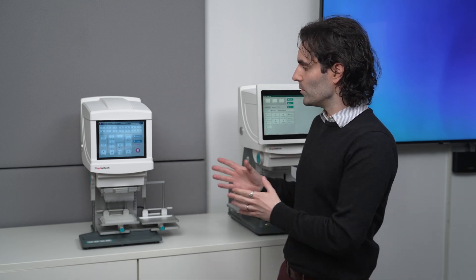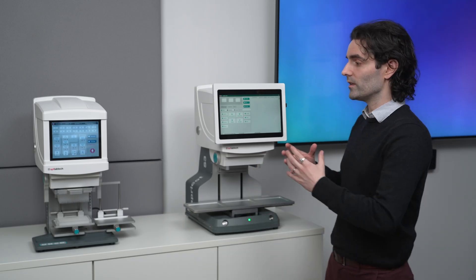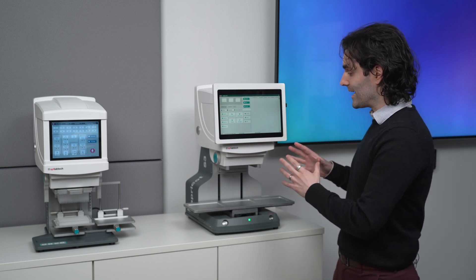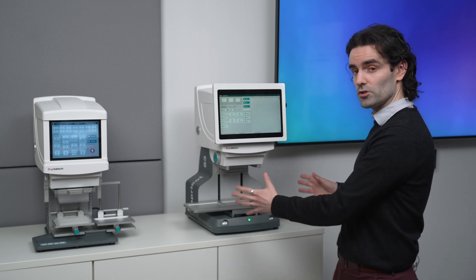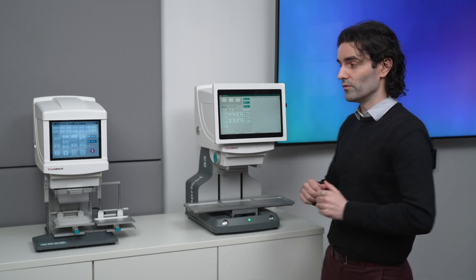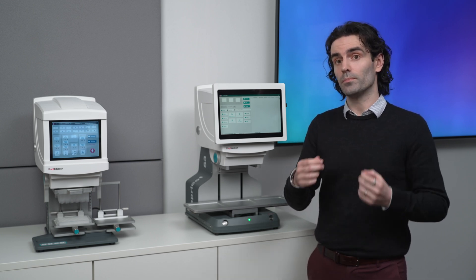Moving on from the S1, here we have the S3. The S3 is very similar to the S1 — it has a lot of the same strengths in that it's very easy to use with a nice big interface — but it actually has an automated deck. In this case, you have an additional deck position, three total, and you can do the same kind of liquid handling tasks, but the plate movement is automated. We still use the Easy Load tip system and the exchangeable pipetting cores.